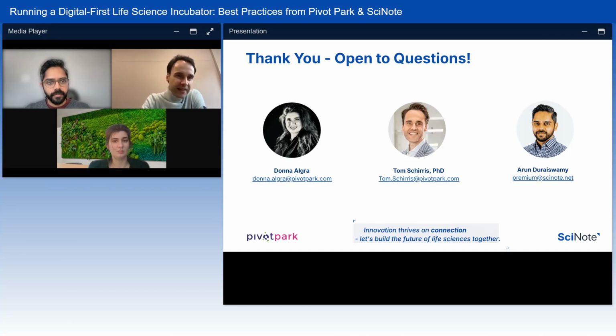And I think that is also one of the advantages of SciNote. It's flexible, so you can just design the structure to your own needs. And that's also what I said with the Marvin ChemAxon. It's really helpful to have such features in as well. So I think it's just dependent on the company how they actually run the ELN, but it works for them.